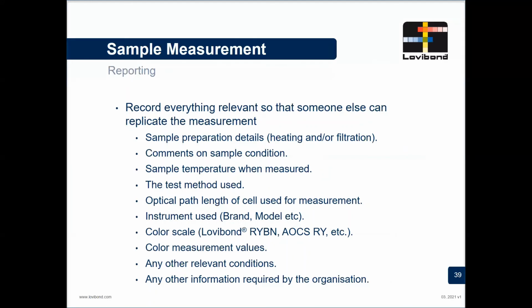And then we come to reporting our result here. So basically what we're doing is recording everything relevant so that somebody else can replicate our measurement. So when your supplier or your customer gives you a measurement result, or you give them a measurement result, they should have all the information needed to be able to replicate that. So they should know about what heating you did, what filtration you did, what you thought about the sample, what your measurement temperature was, what method you were using.